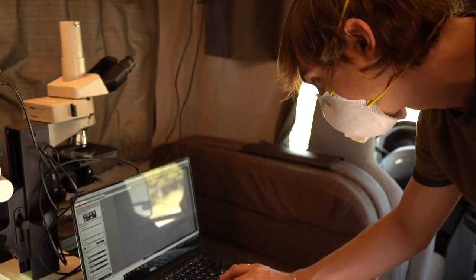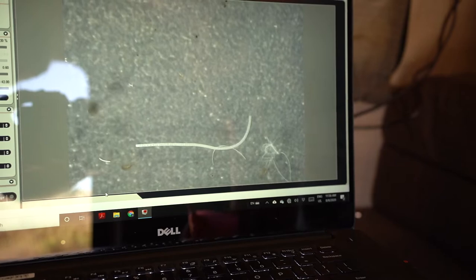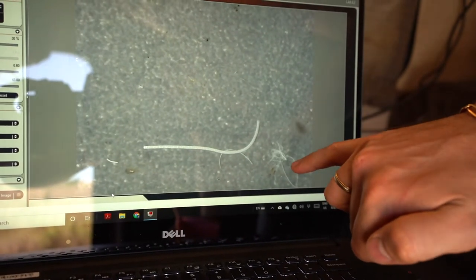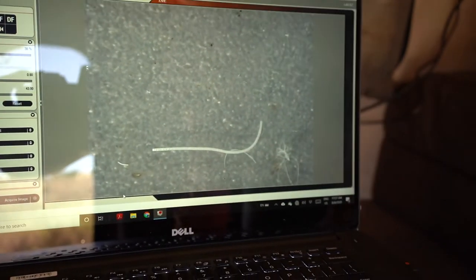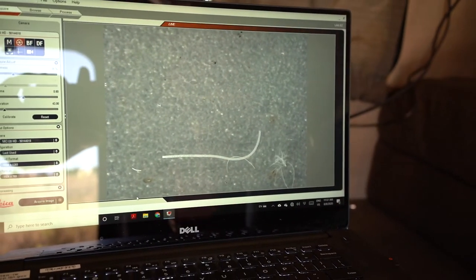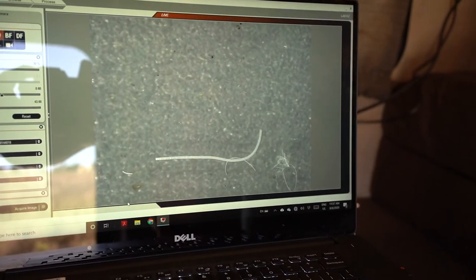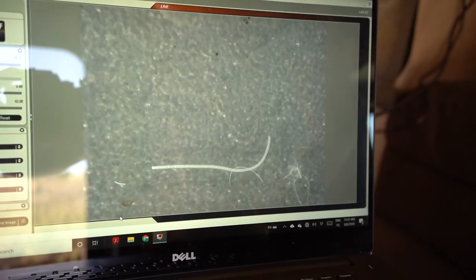So what do you see there? All right, so we are just switching on the camera right now. But I can see already that there are two pellets there on the side. This is a pellet of the small filaments, this is one of the large one, and this is one of the small one. In the papers it's described that there are mainly two types of white filaments: Large Sulphobacteria — what they call the large one and the small one. So obviously we are seeing the same thing here.